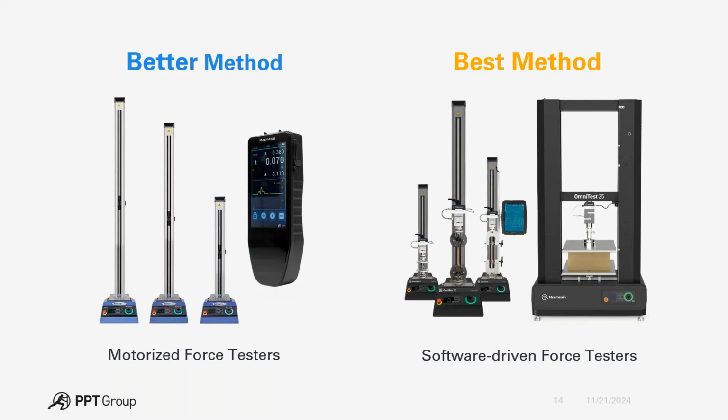In other instances where you want to apply a specific load and then measure what the peak deflection is, you're at a bit of a loss, because especially in cases where you have different sizes of samples that require different loads, you'll always have to constantly go in and program. And again, the more you're asking operators to be involved in the processes, the more error you're introducing into your testing environment.